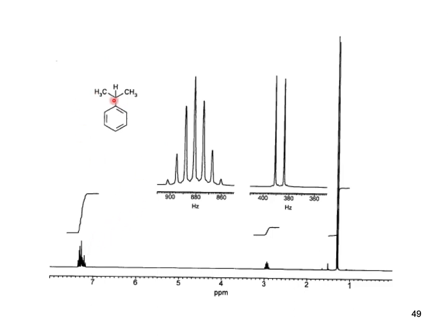So you can see this is the NMR spectrum of this compound. How many different types of protons are in this one compound? First you have to see, right? One is these aromatic protons, and then the second one is this CH3, which has the same chemical environment, and this CH. So 1, 2 and 3, three different types of signal in the case of this compound.